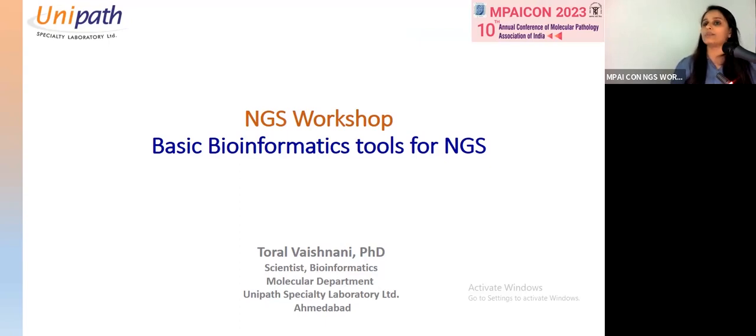So I'll be giving you an overview of the basics of how tools work and what the most common tools are which are used in the analysis process. Commercial tools are many, but I have not considered all of them. So we'll be talking about freely available tools, and I'll just name a few of the commercial ones which are actually being used in the diagnostic industry.